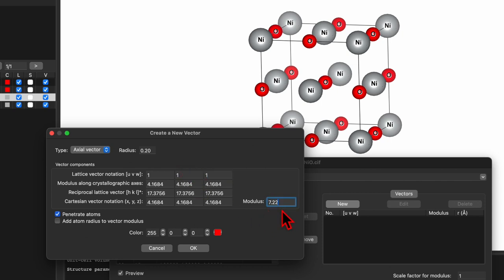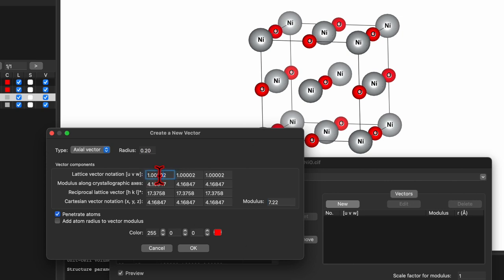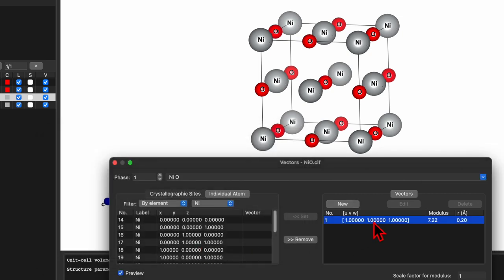The third option is modulus, which is currently 7.22. On the left-hand side you will see the option for 'penetrated atom' and 'add atom radius to the vector modulus' — check the penetrated atom box. The last option is color, so you can assign a particular color for individual atoms. I changed the radius and set UVW to 1 1 1, then click OK to create the vector.